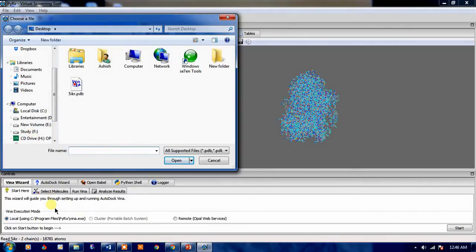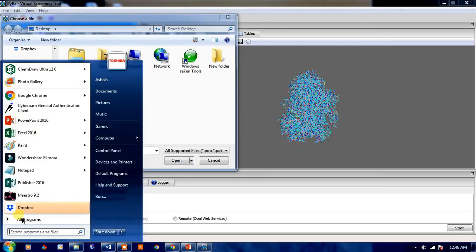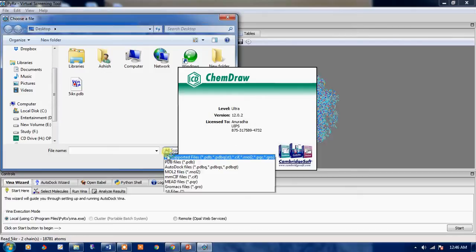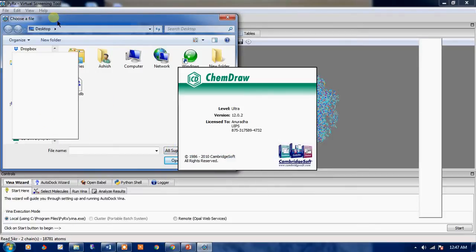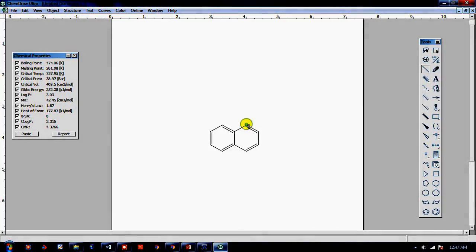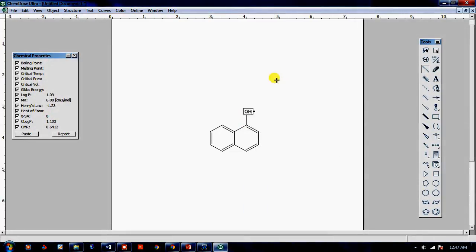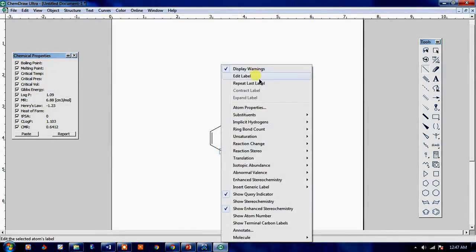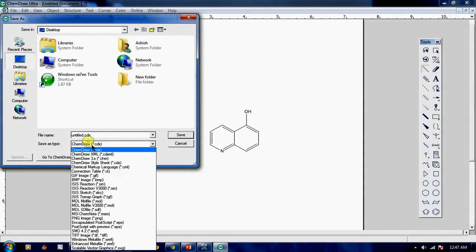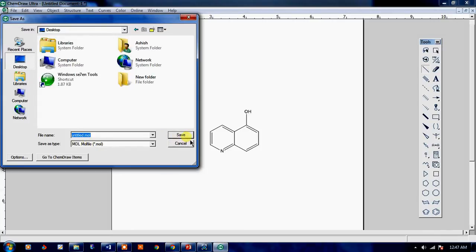Otherwise you may draw it in ChemDraw. You may take the compound in this MOL format. Save it on the desktop in the MOL format.